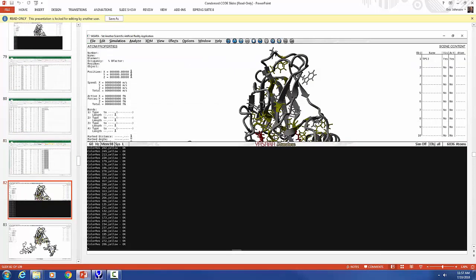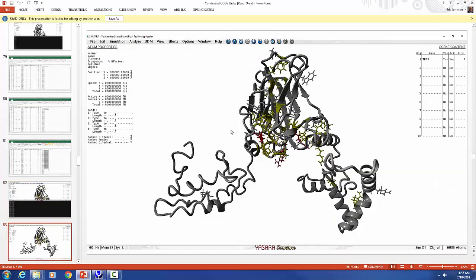And so again, you can copy and paste it into the code area, and you end up with something that looks like this. And so in this case, the higher importance variants have been labeled most importantly with red and with varying degrees yellow in different spots, right? And so you can see that some of these residues are located in a specific three-dimensional area of the protein.